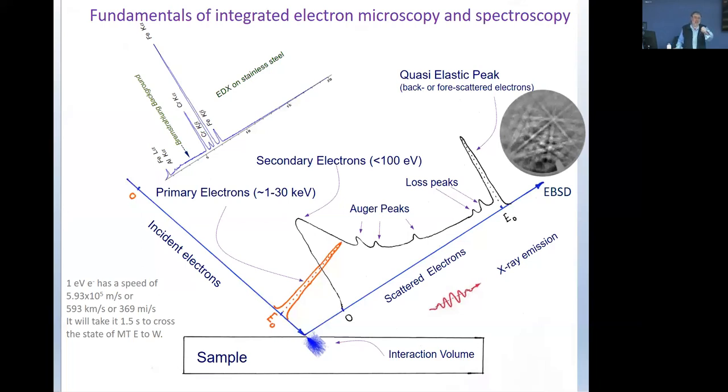Rama, you had a question. Yes, sir. I'm going to be revealing some of my ignorance, because I'm not a geologist. You talked about crystal structure, phase, and orientation analysis that you are able to do. Crystal structure, I understand. What is the phase and orientation analysis, and how do you do that?